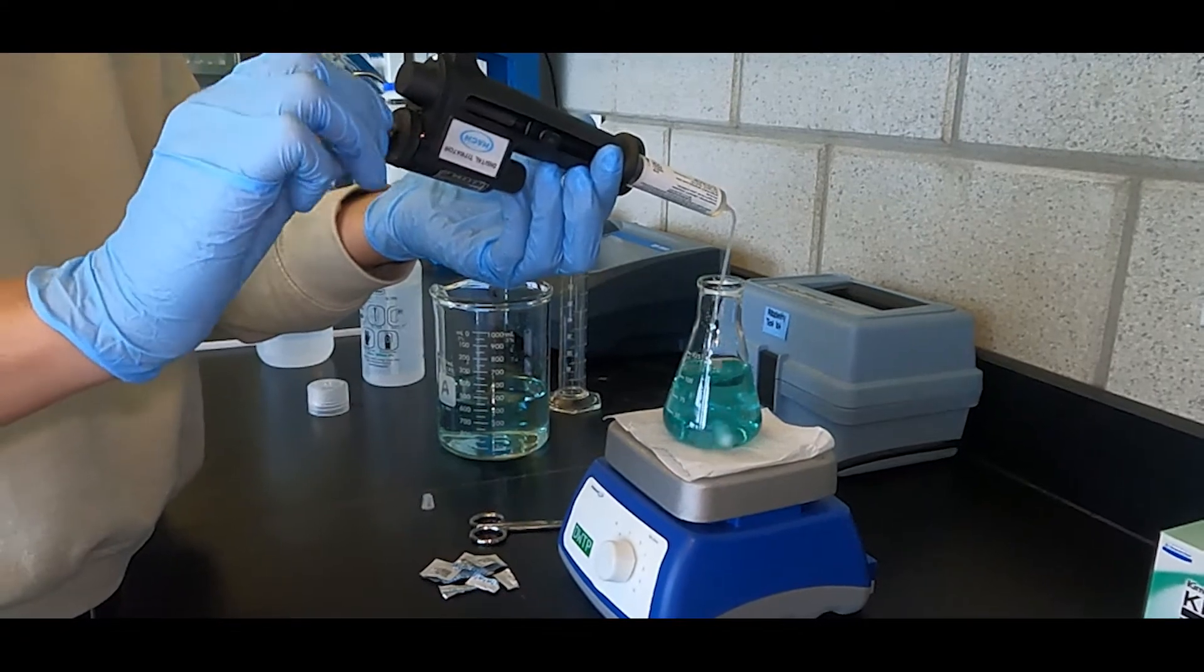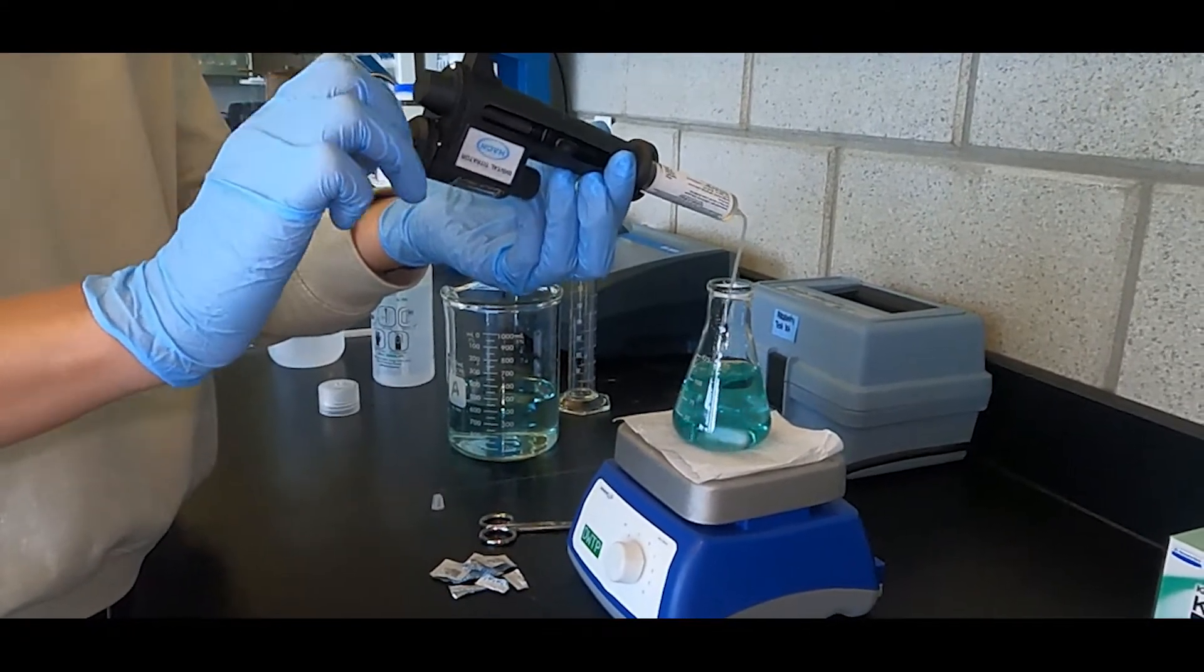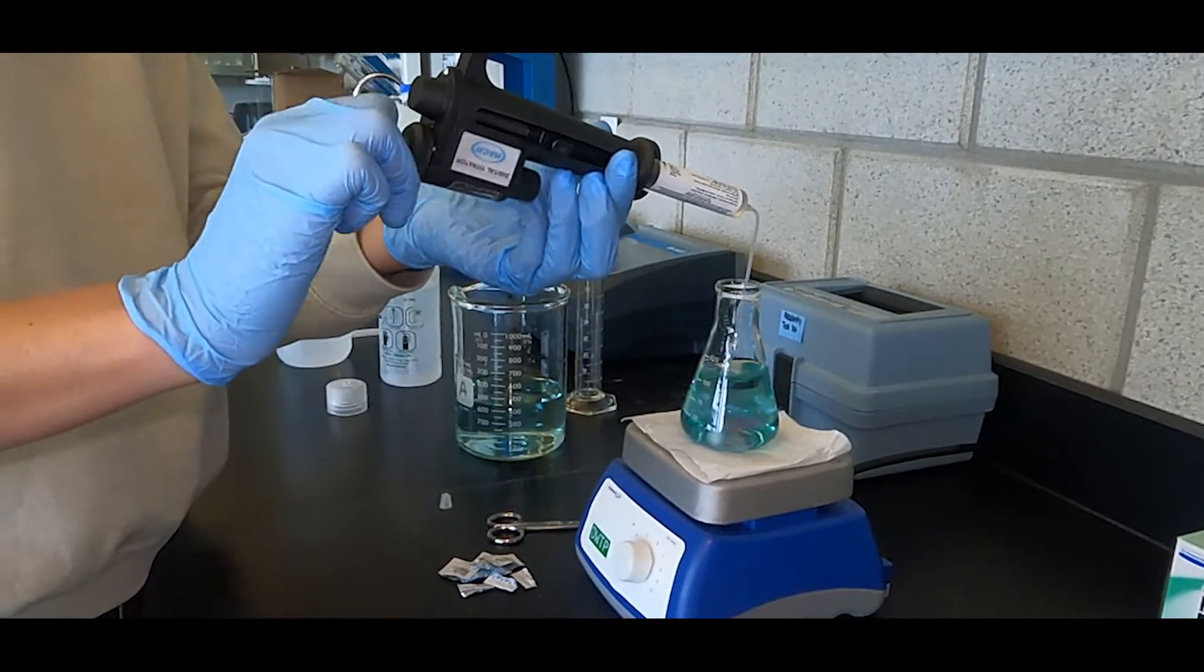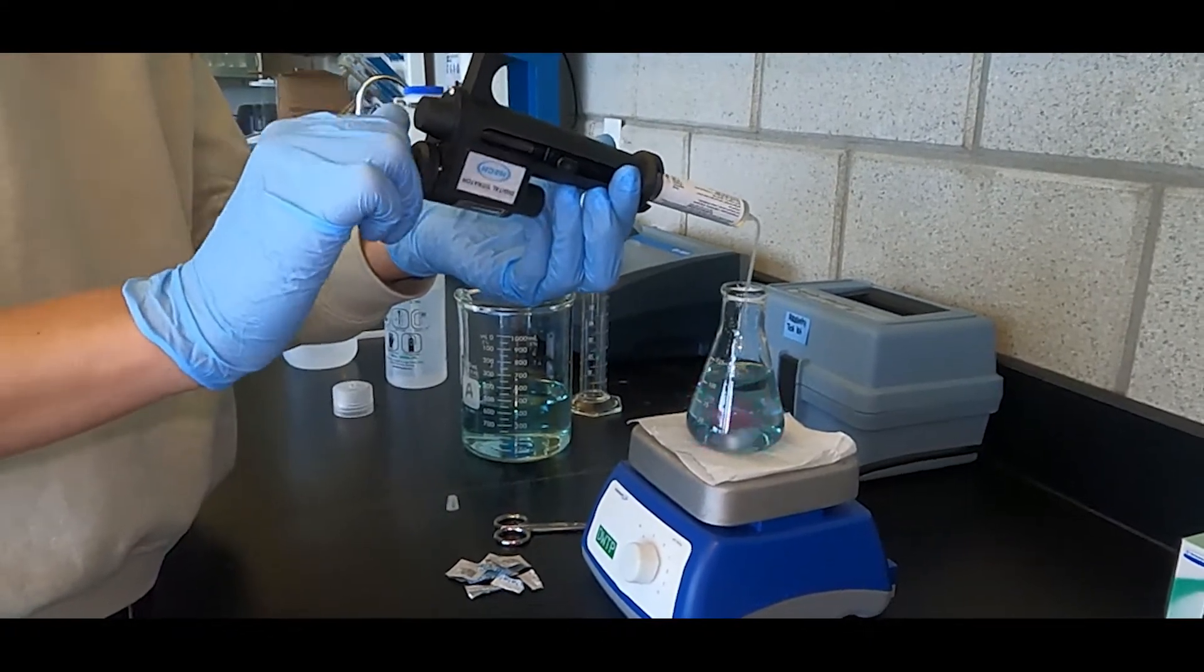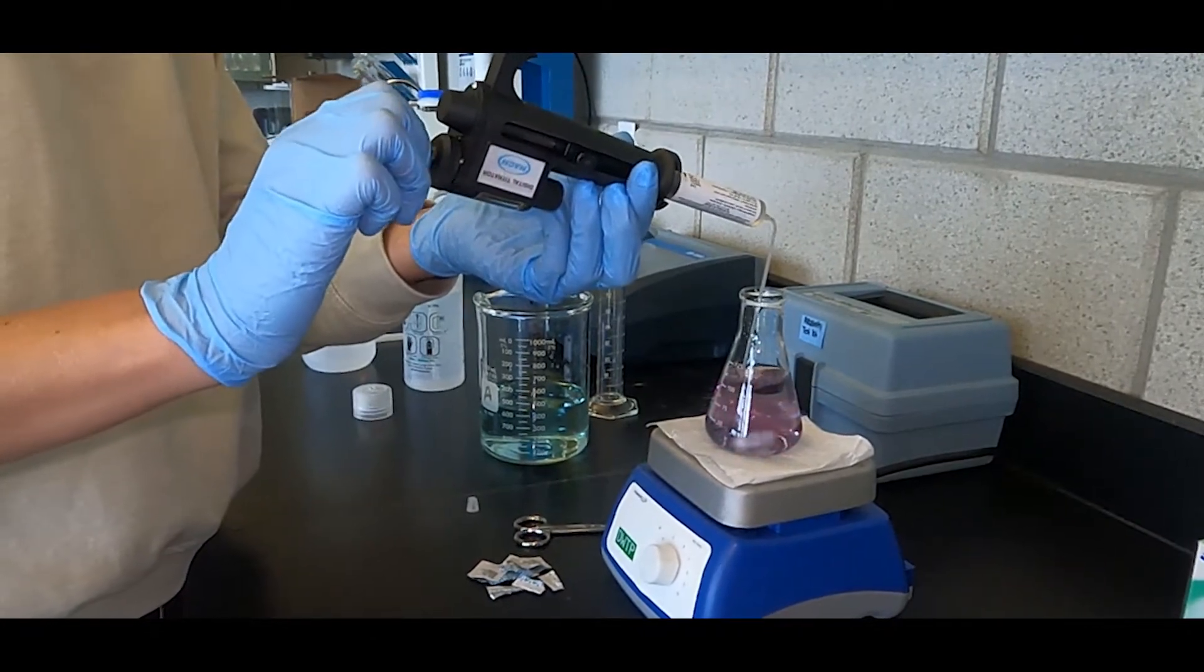During the titration, you will know you are approaching the endpoint when you start to see flashes of color change that persist for one second or more. It is advised to add acid slowly as you get closer to the endpoint to ensure you do not overshoot it.